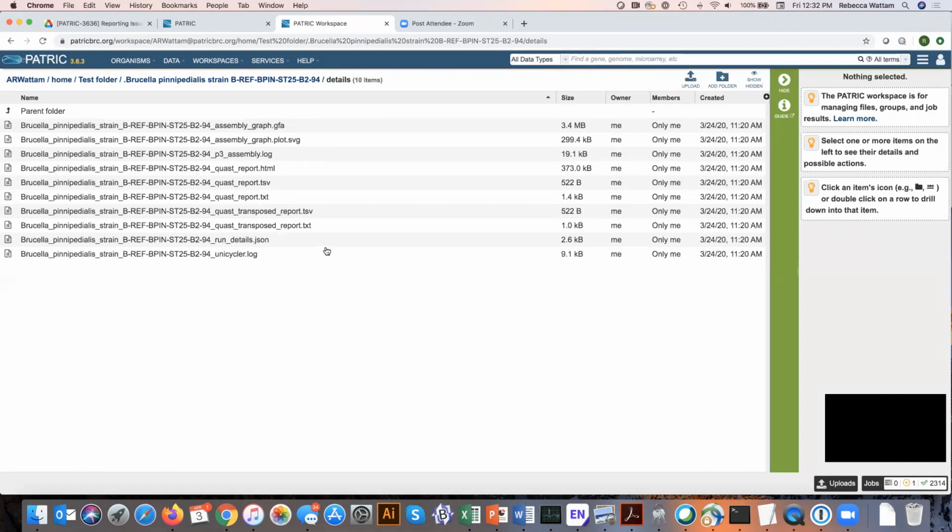And we also provide a JSON file. A JSON file stores simple data structures and objects in JavaScript Object Notation, which is the standard data interchange format. It's primarily used for transmitting data between a web application and a server.